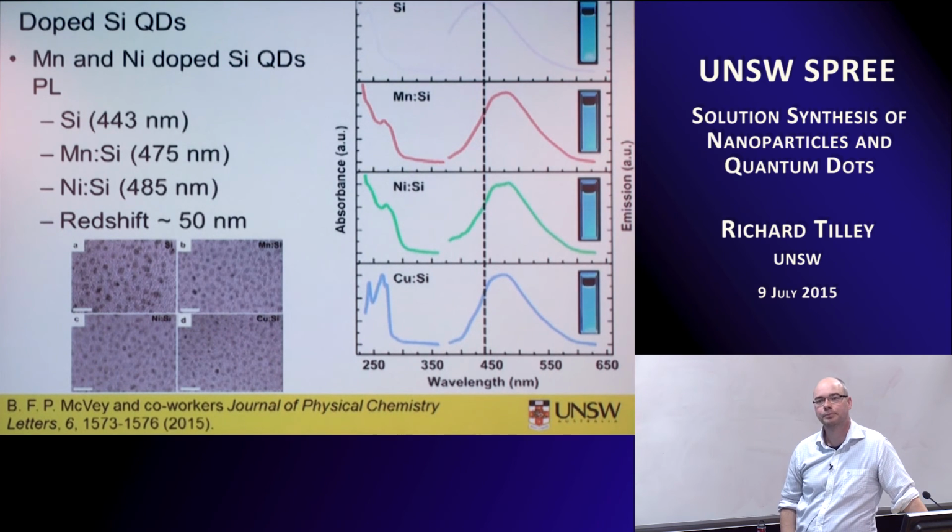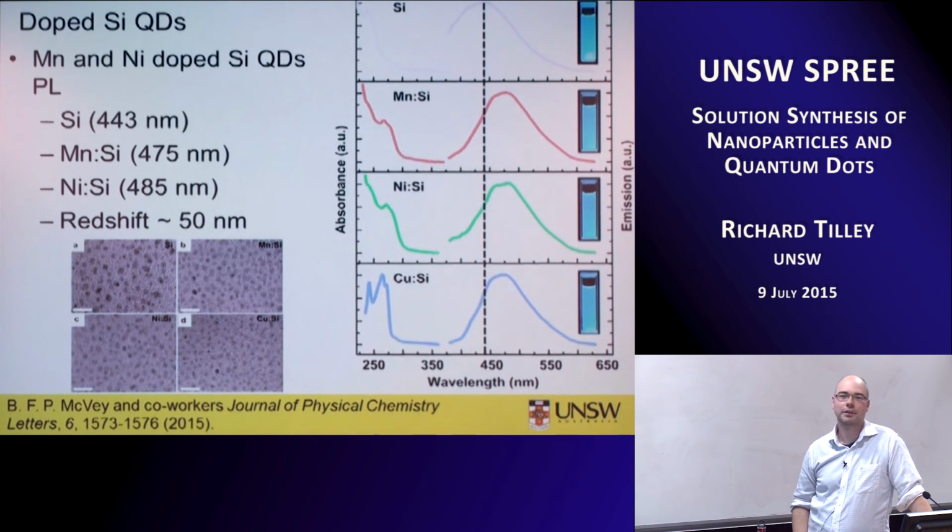Just a short comment. I think there was actually some aberration-corrected work done in Daresbury on manganese-doped silicon for spintronic applications. They were actually able to show manganese atoms on silicon lattice sites, but that was single crystalline silicon. And if you've got dots, you need a lot of TEM shots to get the right lattice orientation, and you're lucky if you got a dopant there in the lattice, if it actually sits on the lattice site, because as you may know, the activation energy is quite high.